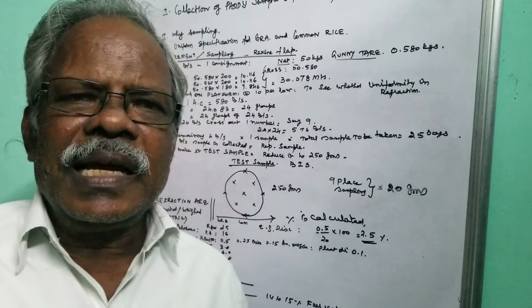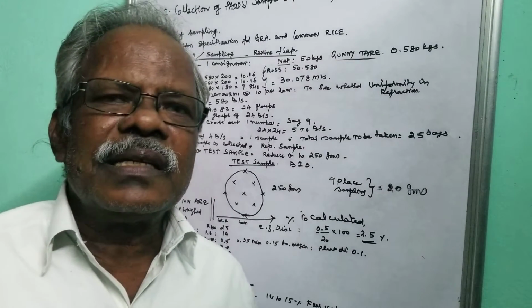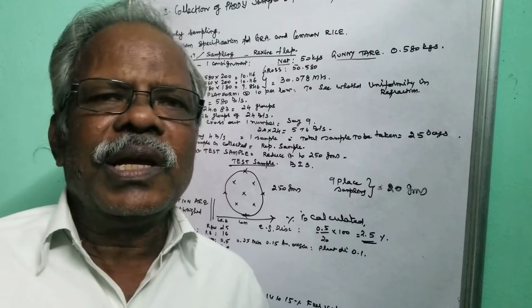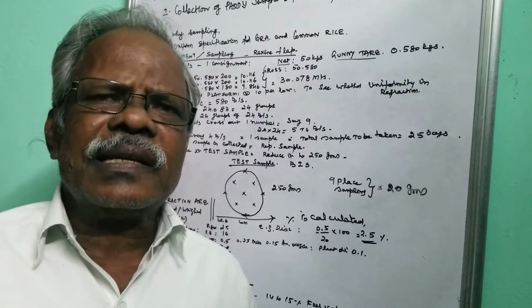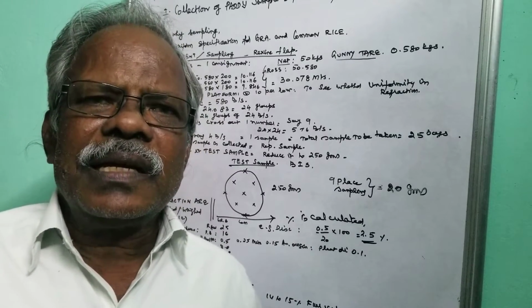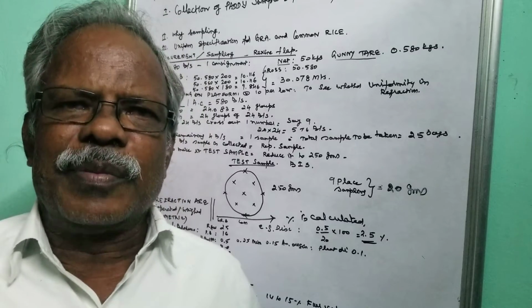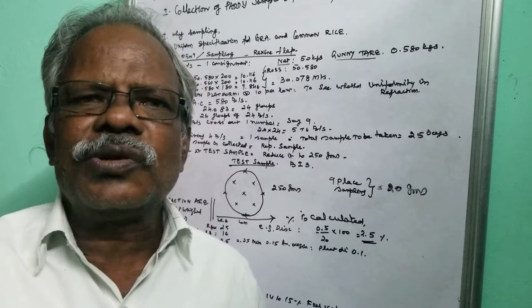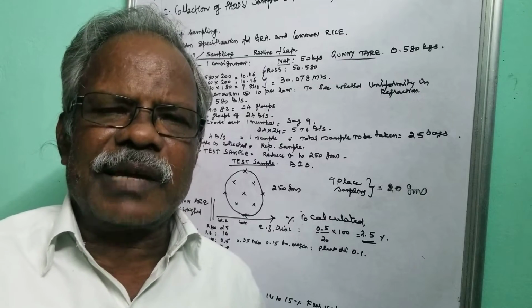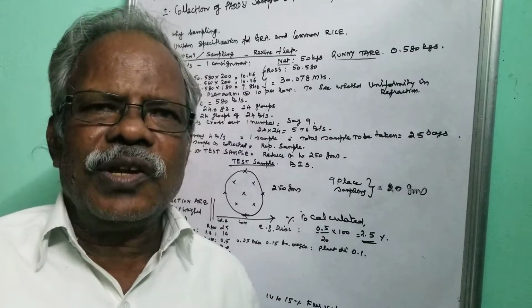We will analyze the percentage of various refractions. Then the uniform specification for grade A and common rice, raw and boiled, that we will see, what is meant by uniform specification. Every year the government of India circulates the uniform specification with reference to the Kharif marketing season and the Rabi marketing season. Kharif marketing season pertains to rice. So every year for the Kharif marketing season, KMS, they circulate the uniform specification.